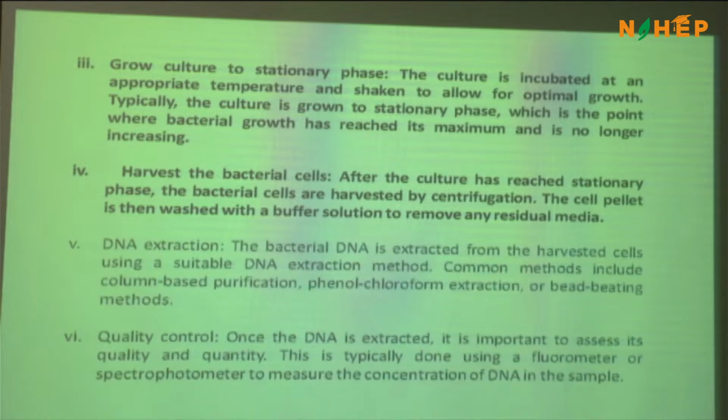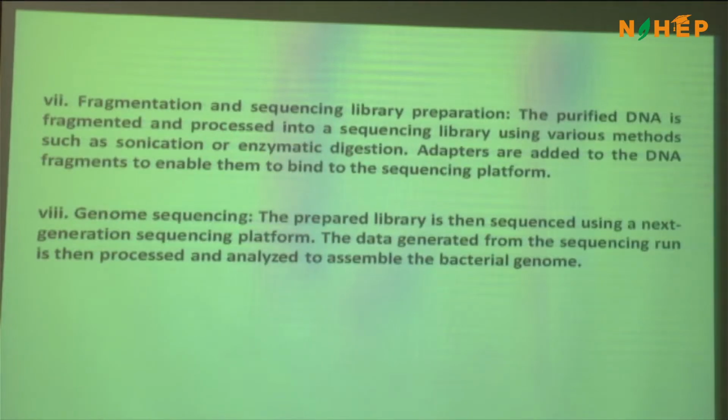Okay, and of course DNA extraction, quality control, we already talked about it, and I'll just skip it. Library preparation, sequencing, that is the flow. You are already quite aware of that.